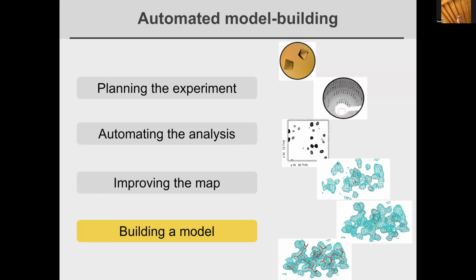And if you want to reduce that problem, you have some options. And one of them is to use that model only to find the sites, but not to calculate phases afterwards. That's an option. And you don't necessarily need to do that.